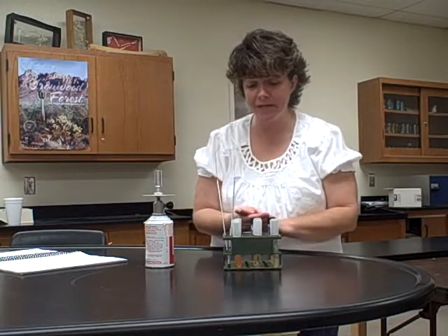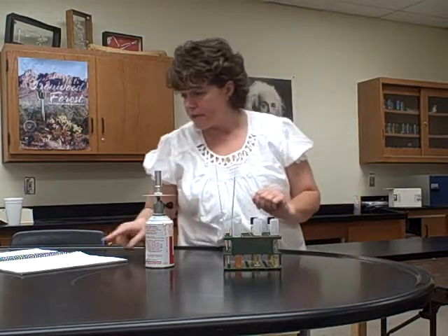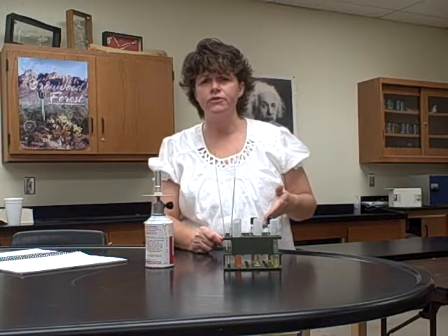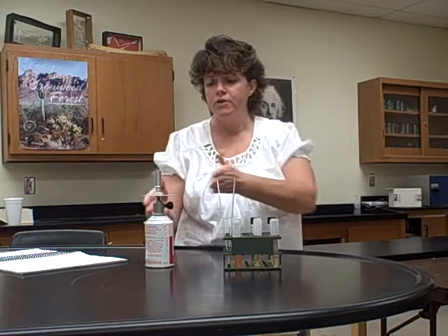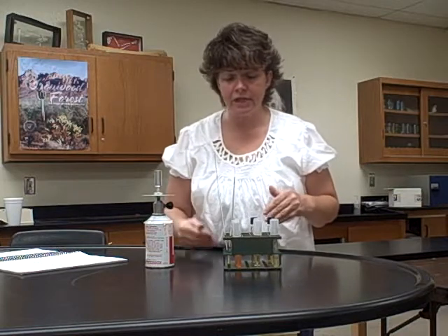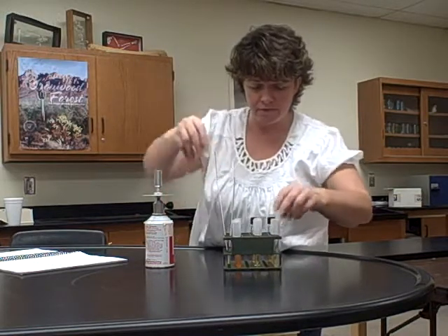So we have all the tubes labeled. I'm going to pretend they're all labeled and they're ready to go, okay? Now we're going to use good sterile technique, which I kind of taught you the first week of class, where I don't want you to ever set anything down. So of course my flame would be going, okay? And we're going to be using the needle and the loop. So what I'd like to do is start with the broth. Okay, oh, I have these all backwards.